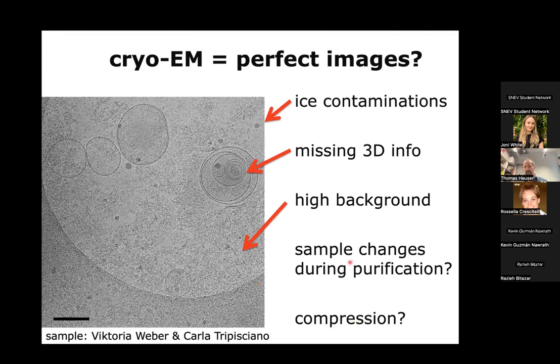So for example, in terms of sample preparation, there are some concerns if you use, for example, ultracentrifugation, if you use a lot of high G forces. Could that be the reason that huge G forces make one vesicle go inside another vesicle?